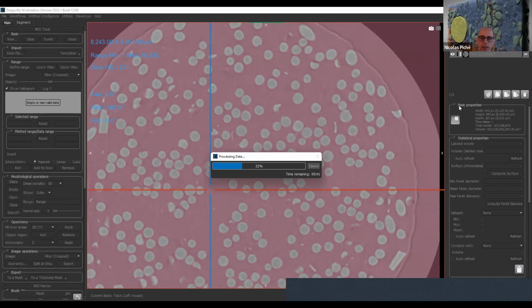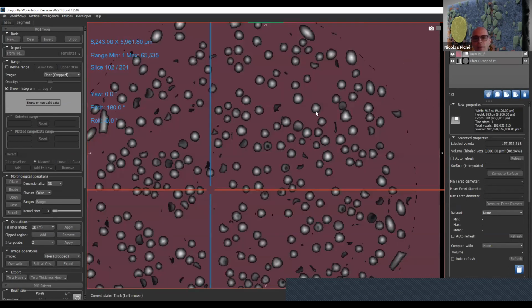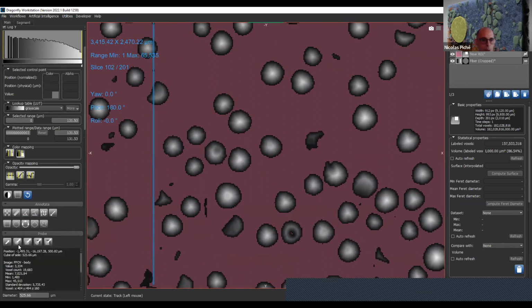So now it's computing. The distance map is computed in multi-thread. It's quite fast. This is a laptop, it's not so fast, but it's a good implementation of a distance map. If we look at the distance map itself, and I probe, I can see that in the distance map, it's the distance to the exterior. The value is in microns, and it's the distance to the closest point on the frontier, in fact. So it's what we call a Euclidean distance map.